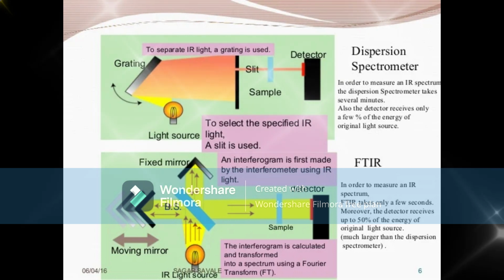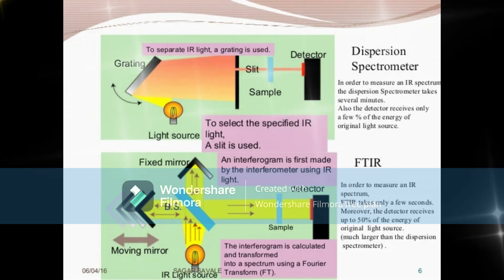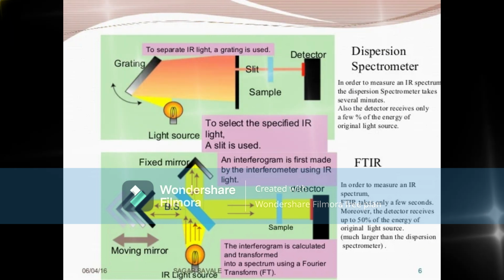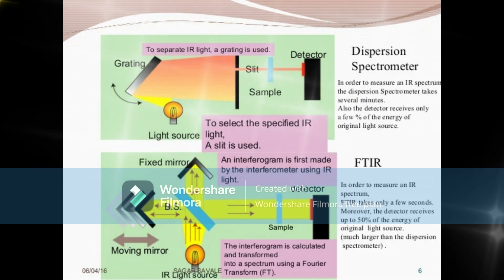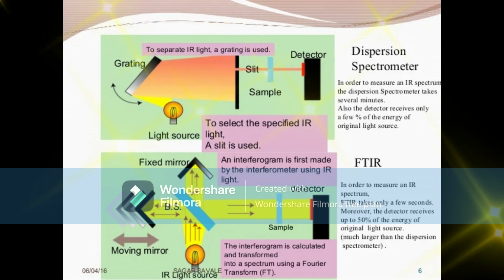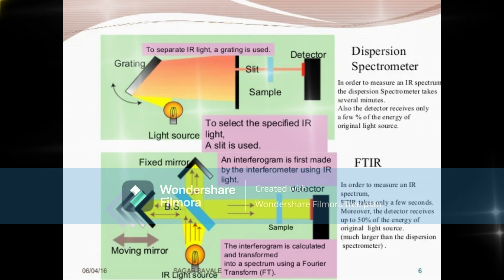These spectrometers suffer from wavelength inaccuracy associated with the backlash in the mechanical movement, such as the rotation of mirrors and grating. The principle involved in Fourier transform infrared spectroscopy is different, centered on the Michelson interferometer, so that the method can also be called interferometric infrared spectroscopy.